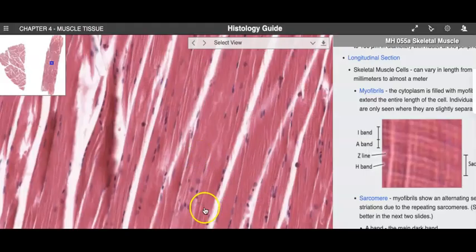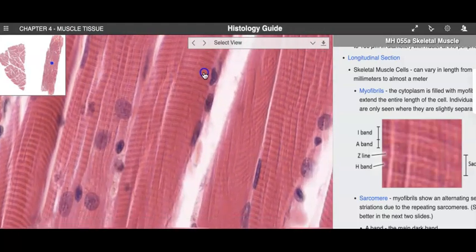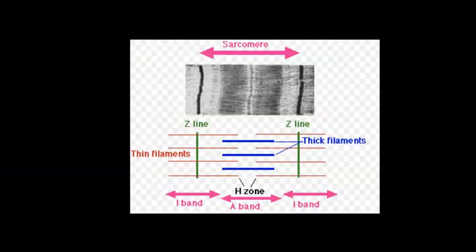So if I jump back over here and zoom in, let's say over here, you can see again a dark line going between the light and another dark one going between the light, and then you have just a generic dark band that is there. This really is the dark band, and then here's the light.